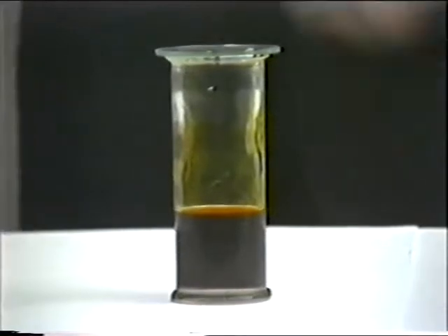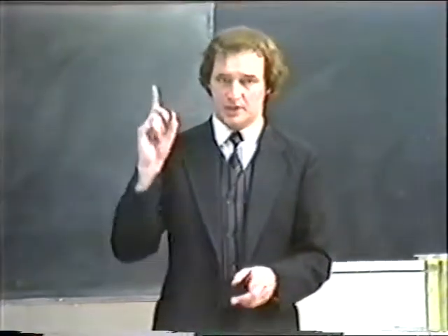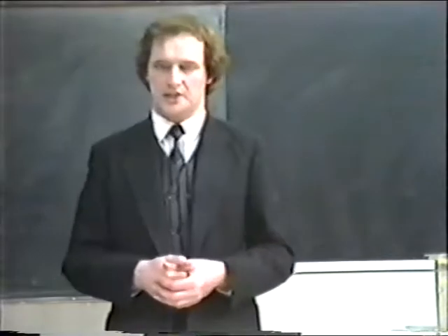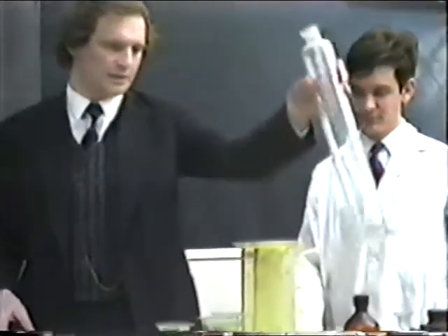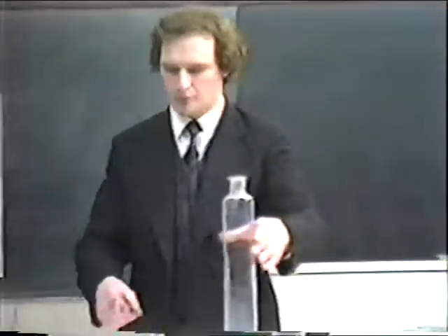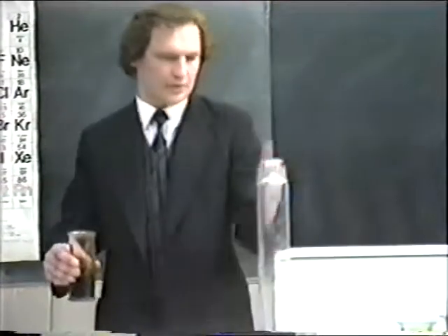Excuse the slight cough, I'm getting rather filled with this chlorine gas. And you notice the dense red colour here, which is due to iodine. Incidentally, iodine forms a brown solution, as we can see here, but there are several other compounds which also form a brown solution. So we have one particular way of distinguishing iodine solutions from other brown solutions. And I can demonstrate this by pouring a small portion of this dilute solution into a tall measuring cylinder.